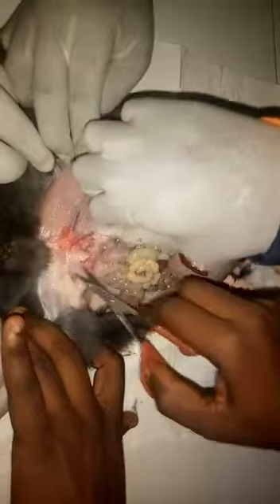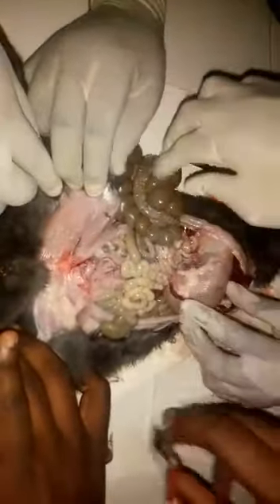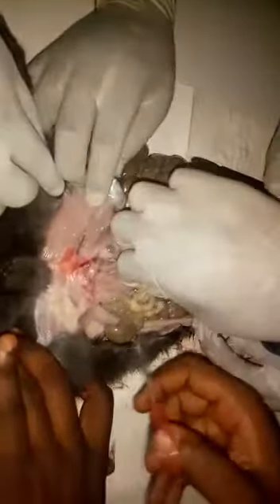Very good. So I think these are some of the major organs that we need to identify in this rabbit. This is the anus. Yes, this is the anus. So I think that is that.